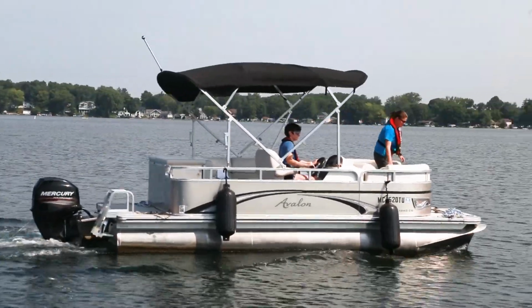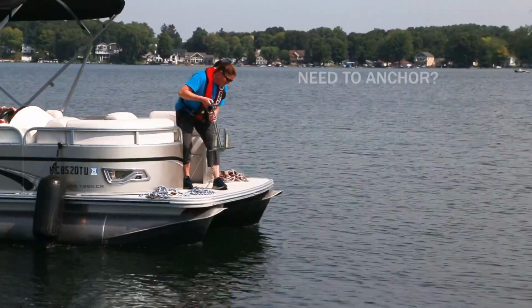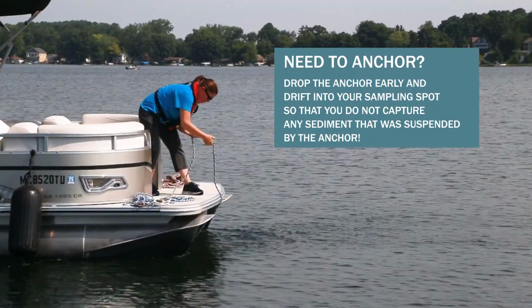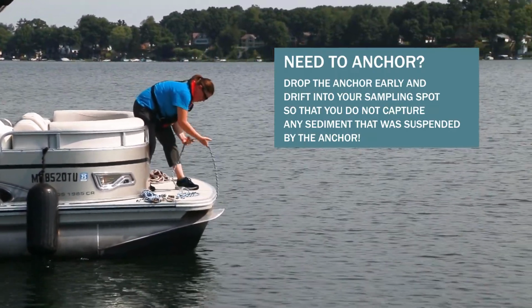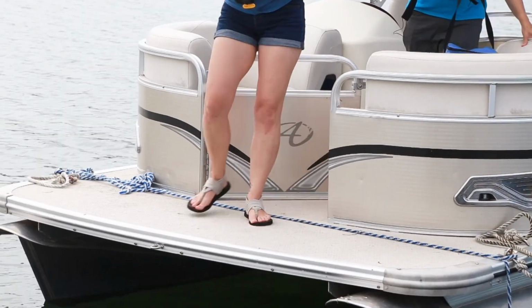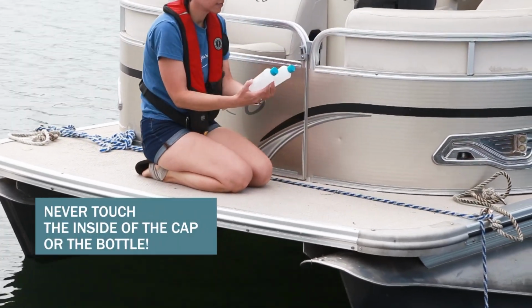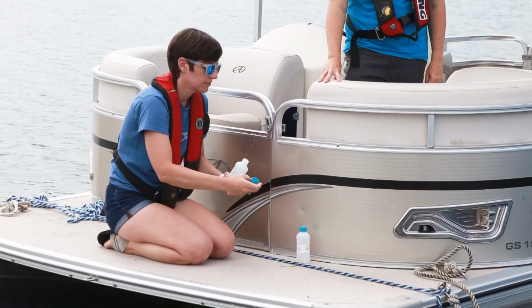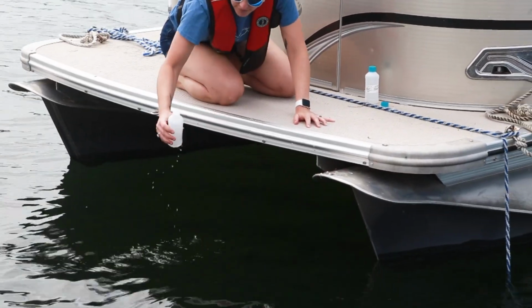If you need to anchor, make sure you drop your anchor before the deepest location and then drift to your sample site. This will ensure you do not collect any sediments that might be suspended from the anchor. Once over the deepest location, unscrew the bottle and make sure to never touch the inside of the cap or bottle. Then rinse the bottle with lake water twice.